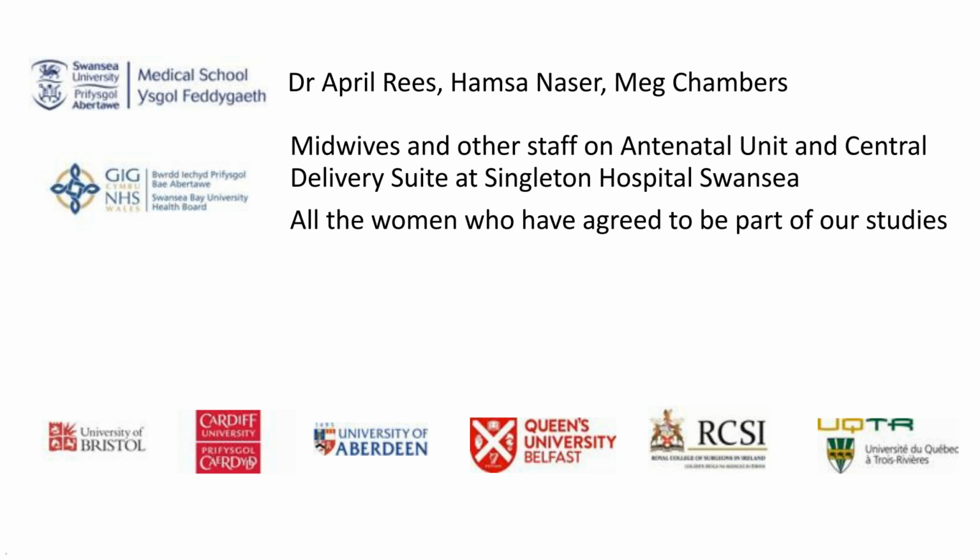Thank you so much. Now, you showed a solution for untouched PBMC isolation. Is it possible to do further magnetic isolations after the PBMC isolation kit? I can take this one.